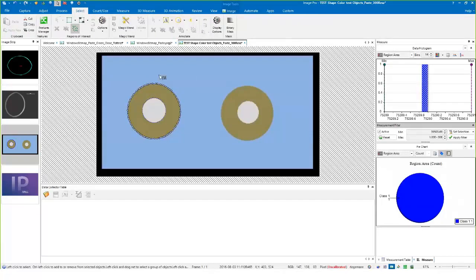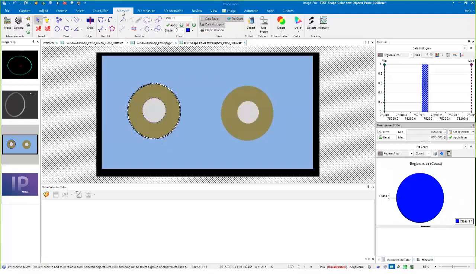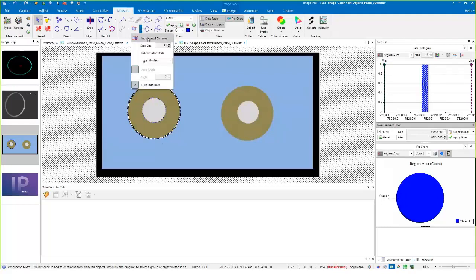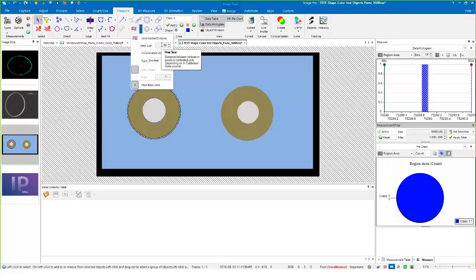Let me go to Select and just get rid of my region. If I touch on the object here, now I have the outline. The function that we use is under Measure and it's one of these relative tools. Remember the relative tools can only become available once you highlight outlines or traces or two line types.